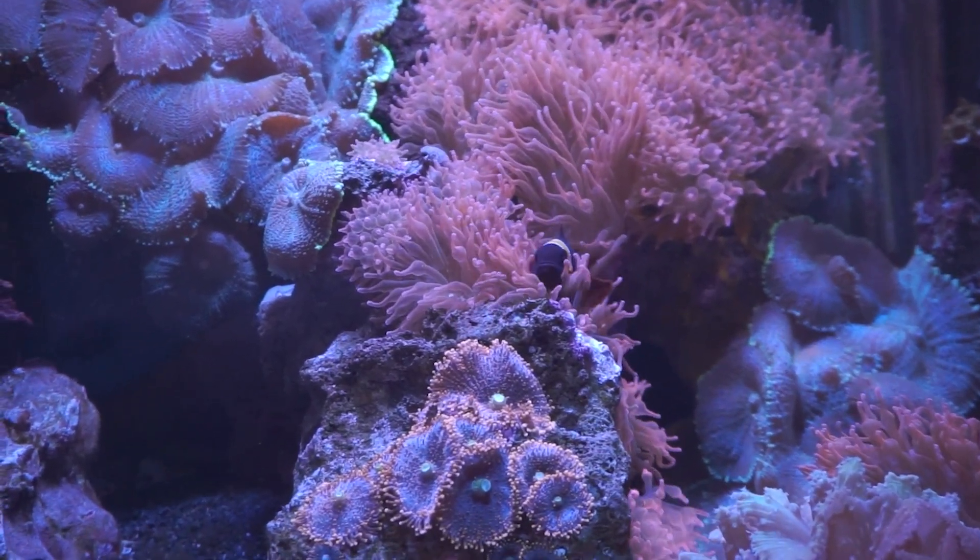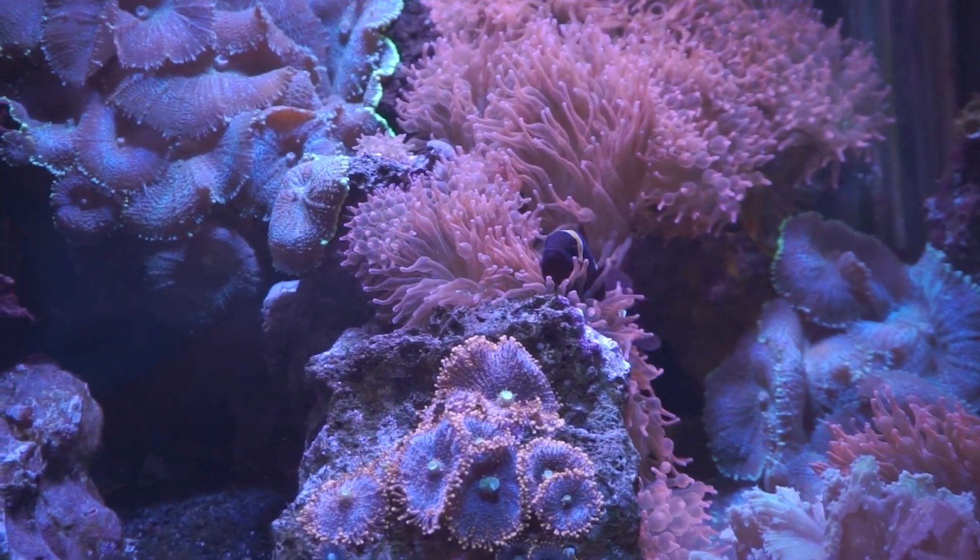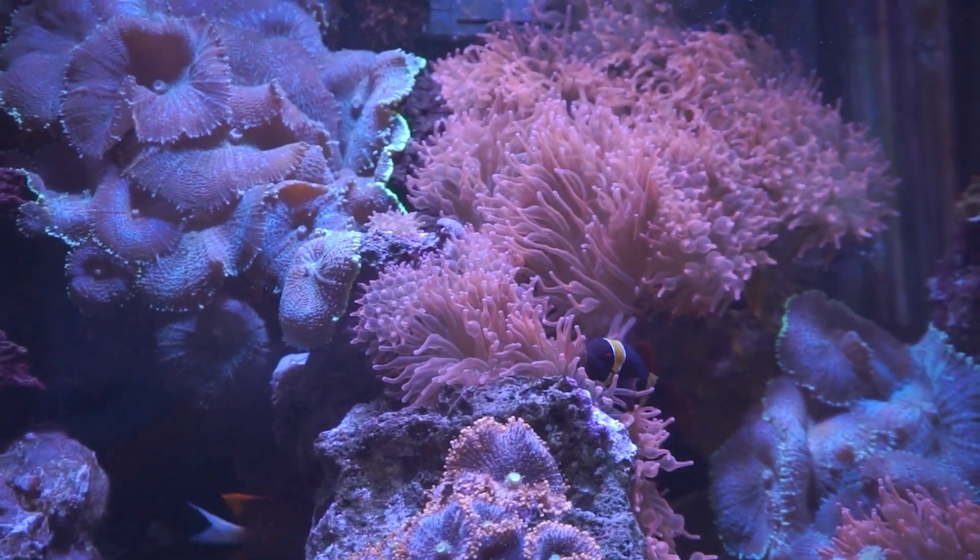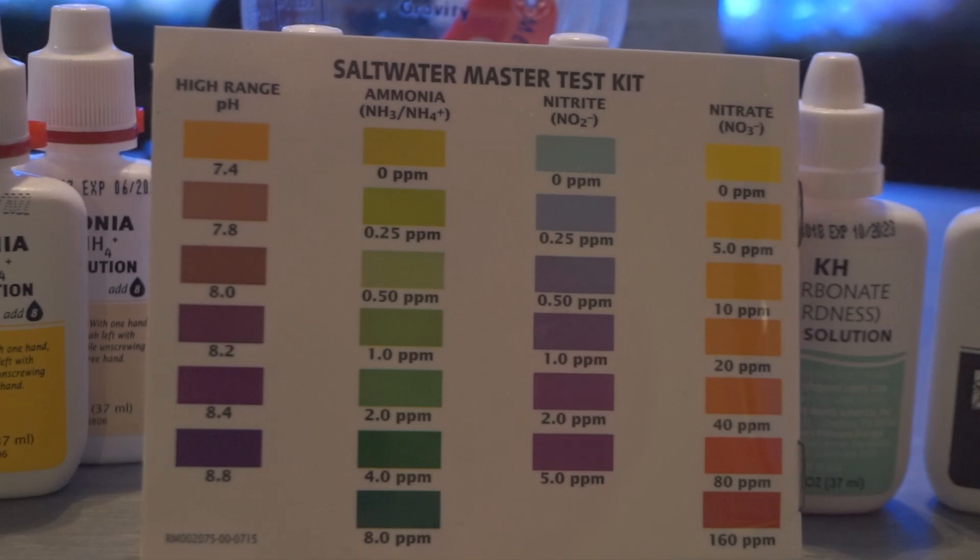Now even though you are seeing a ton of hair algae and the water being low, looking around at the corals everyone's looking pretty great and pretty good so far. Now looping back to the test kit you will also have a test sheet that will actually give you the colorations that the liquid can turn so that you can best tell what level is your water at parts per million.